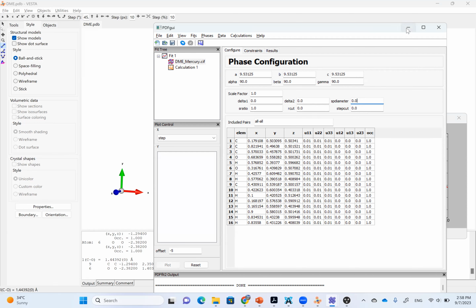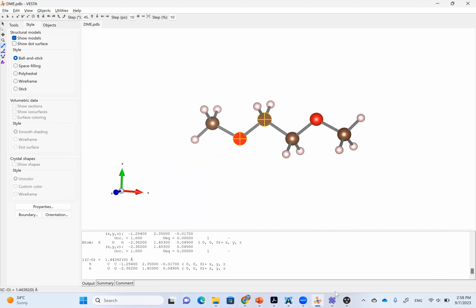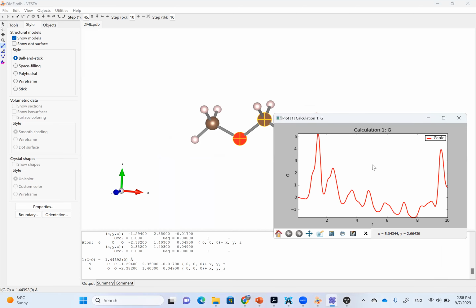But there's a potential challenge. What if these 2 molecules are very close? Actually, some of the peaks in this region also come from their intermolecule correlation, right? So if they're not fully isolated, there are always potential issues with this kind of peaks.